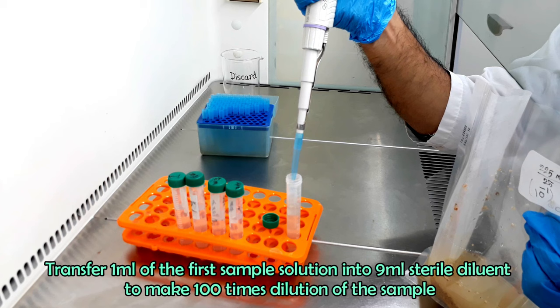You can see countable number of bacterial colonies in 10 inverse 5 dilution plates. Let's count the colonies of 10 inverse 5 dilution. We found 762 colony forming unit in trial 1 plate. And here we counted 734 colony forming unit in trial 2 plate.